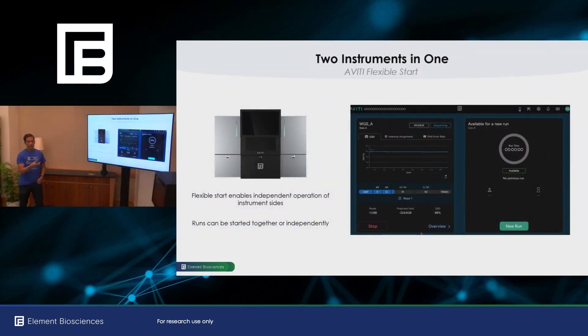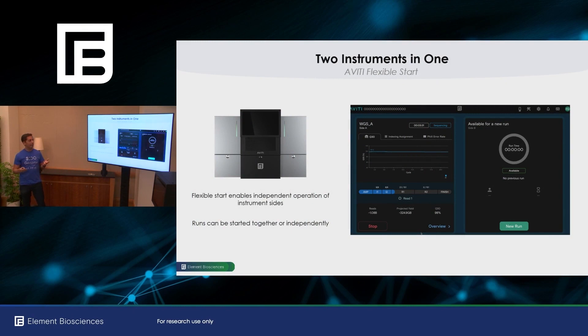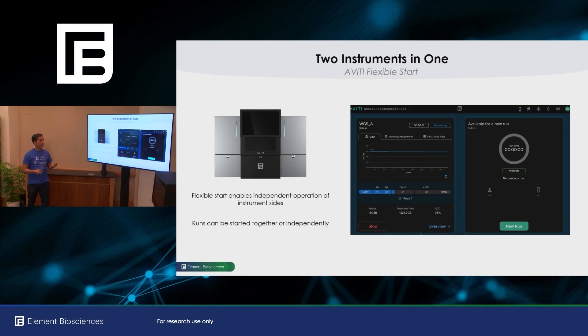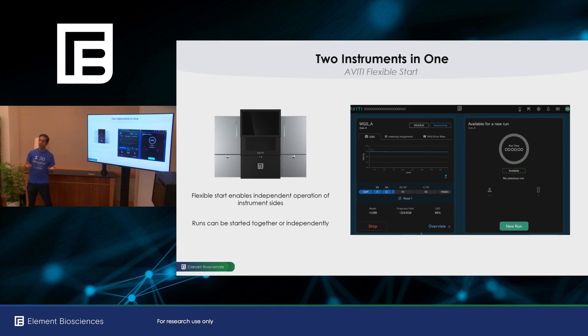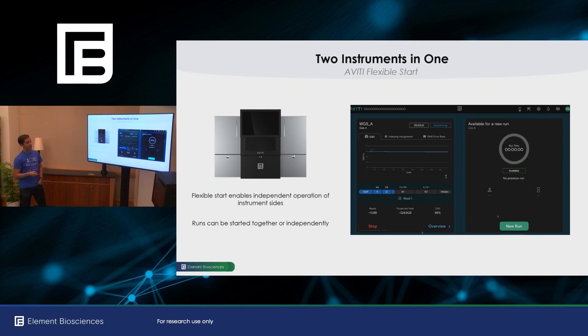And recall that the Aviti is actually two instruments in one. So each side operates effectively independently. You can set up one side or the other or both at the same time. And then if one side finishes before the other, you can start a new run on that side while the other one is still running. Let me walk you through that, which is a feature we call FlexStart.